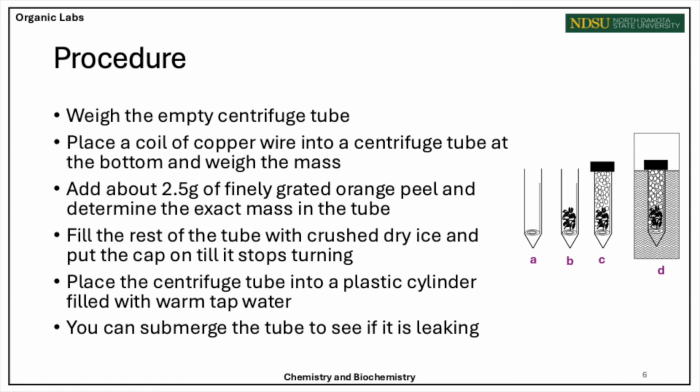There are 2 very important notes here. 1, when you're handling dry ice, make sure you're extremely careful. In order to crush the dry ice, you can either grind it up with a mortar and pestle, or you can put it in a paper towel and smack it with a hammer. Also, whenever you're putting the cap on, make sure you do not over-tighten it, because this will damage the seal. You also want to make sure it's tight enough though, otherwise your carbon dioxide will escape.